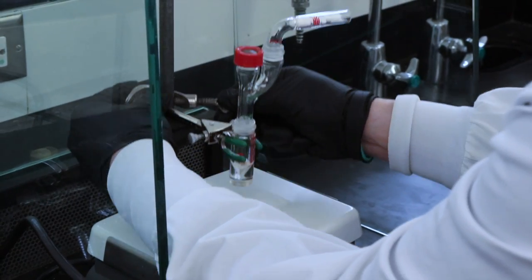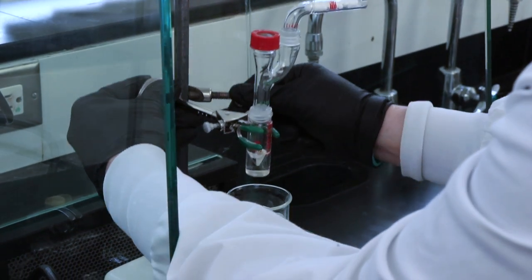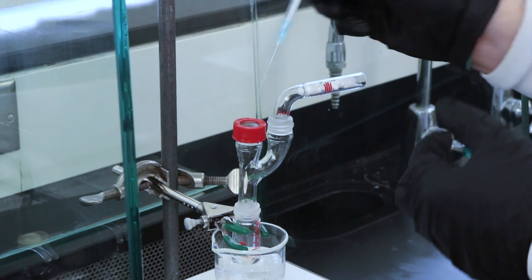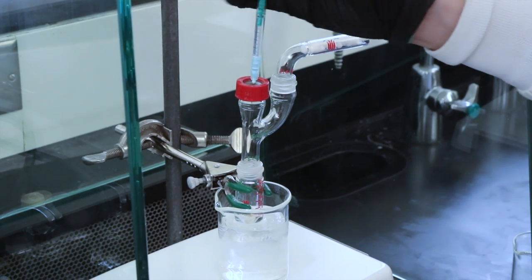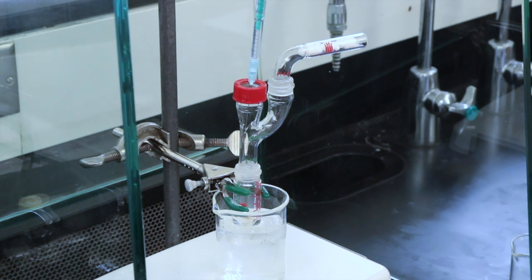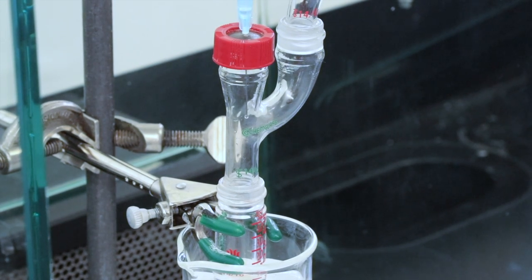Before adding the boron, I'm going to be putting the conical vial into an ice bath. Because the boron complex is very reactive, we want to control the rate of reaction as much as possible. And I'll also be adding the reagent dropwise over a period of 5 minutes, just so that the energy released from this reaction doesn't cause runaway reactions that we don't want.